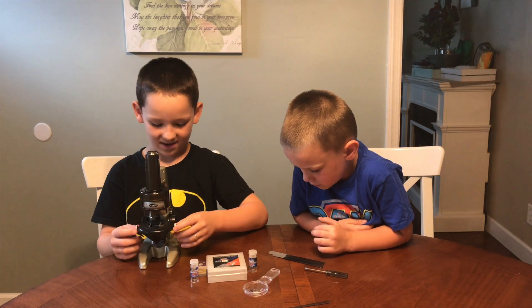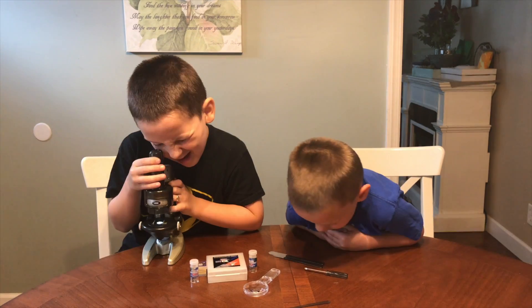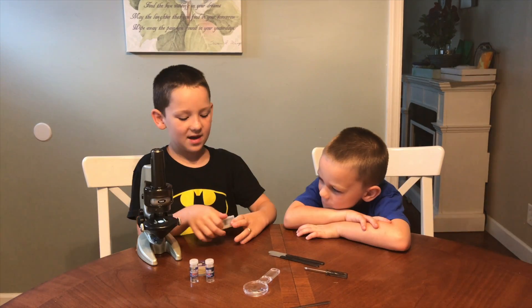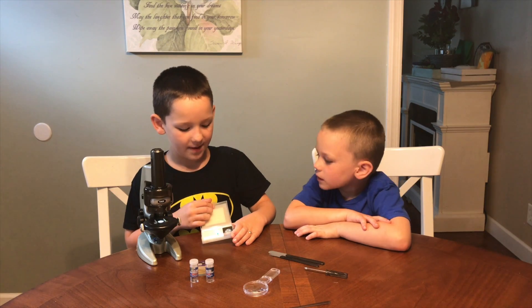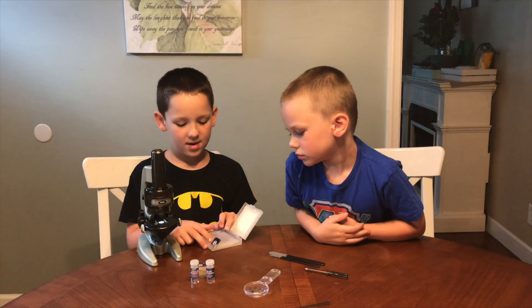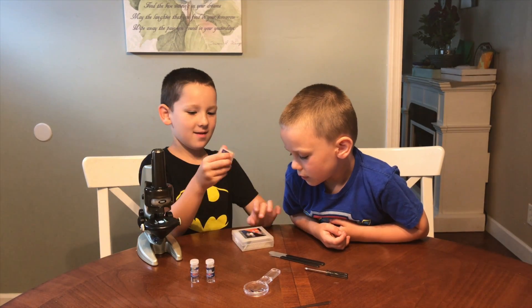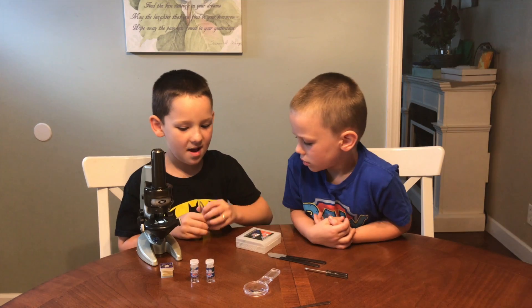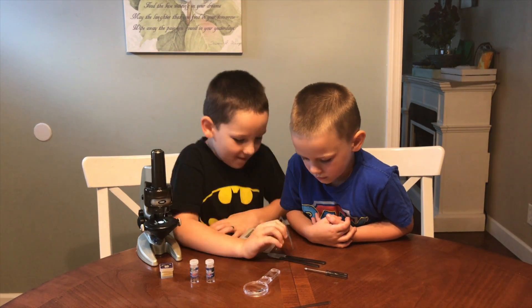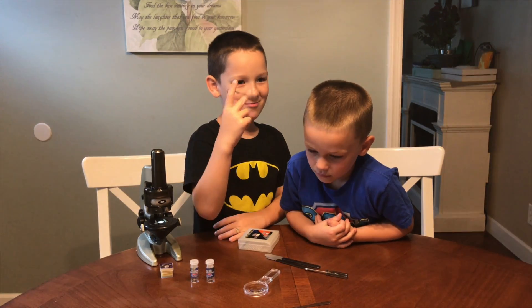That's a very hard word to say — you just spin this thing around. There's a nifty little slide holder with these silver knobs. We have ten slides; two of them are prepared, and then you have eight more you can use to make whatever you want. And we have the slide covers over here in this little box.